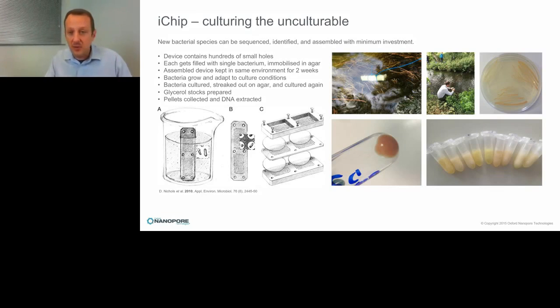In fact, you can probably see in the central picture on the right, a person in turquoise who's just taken a break from fishing to watch this odd fellow collecting water from the river, which is me. So we immersed the iChip in low melting point agarose and then dipped it back into the water, assembled the device, and then put it back into the stream for 2 weeks while I was on holiday, letting the chip do the work. After that, I recovered the iChip, removed all the leeches and slime and other disgusting things.